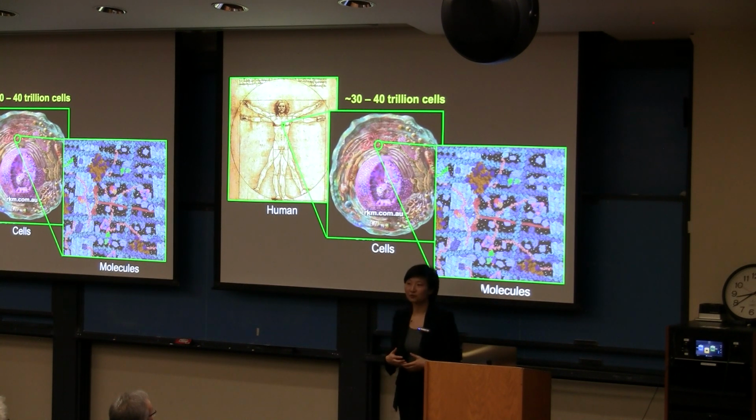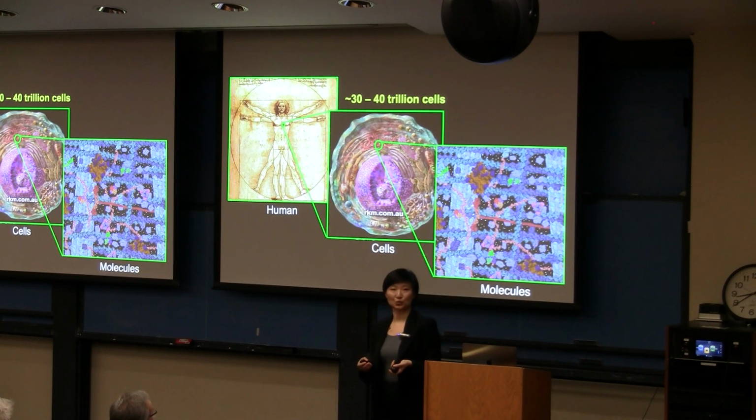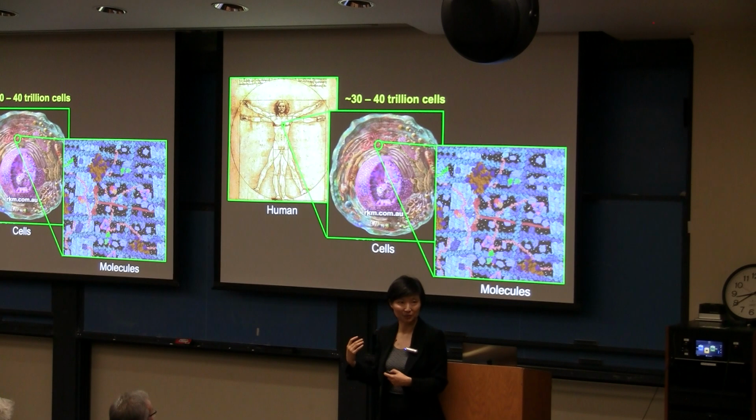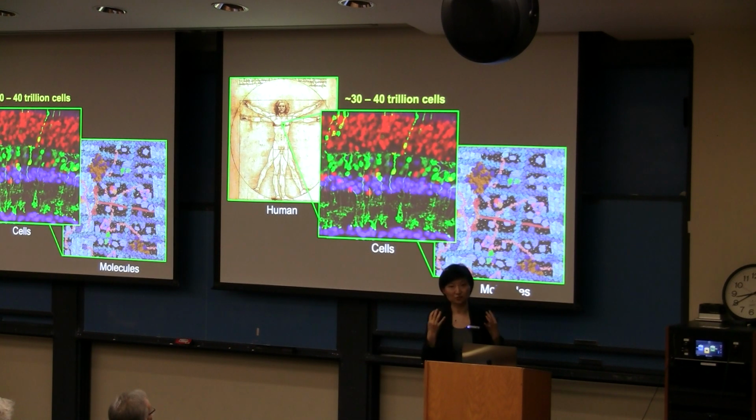So if we could profile individual cells, their gene expression, then we can have a more quantitative and systematic way of identifying cell types. And moreover, of course, there's a sequencing-based approach, but if we can do it with an imaging-based approach, which I just showed you that our imaging capability allows us to do, what you can do is in our body, these cell types, they're certainly not randomly distributed.